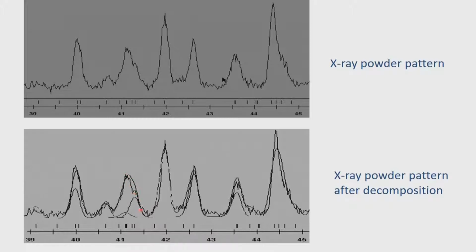the observed pattern. So we have the calculated intensities, the shape of the profile is evaluated, and then you mimic the shape of this. Once you mimic the shape, you have fitted the profile, and this process is known as profile fitting. We can refine this profile with respect to various parameters used to describe the profile function, and therefore we can do a profile refinement.